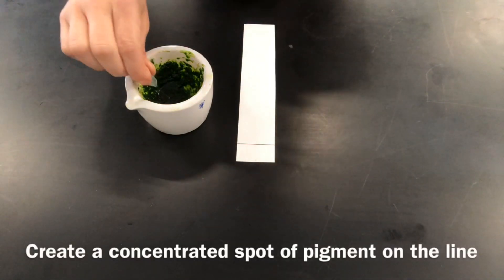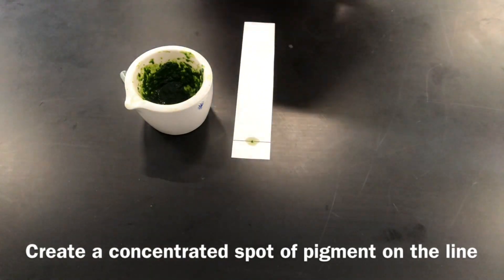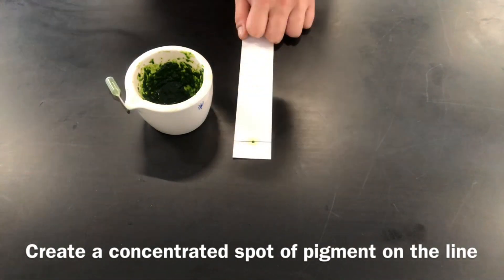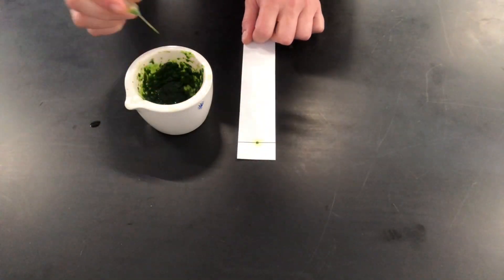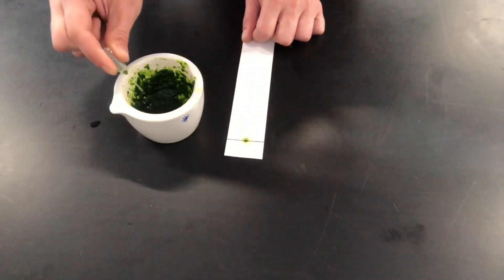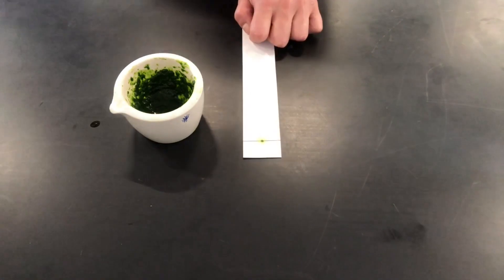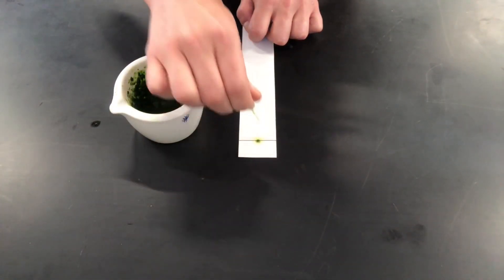At this point you're going to place a spot of concentrated pigment on the line. This can be done in several different ways — here I'm using a very small narrow plastic pipette. It can also be done with a capillary tube, or sometimes with a very fine paintbrush. The most important part is to make that spot as concentrated as possible. In between spotting, you can dry it with a hairdryer to make it more concentrated and then spot on top. Keep doing this until you have a very dark green concentrated spot of pigment on your line.